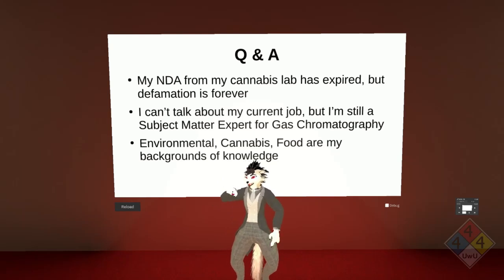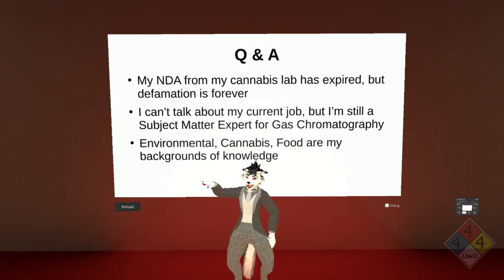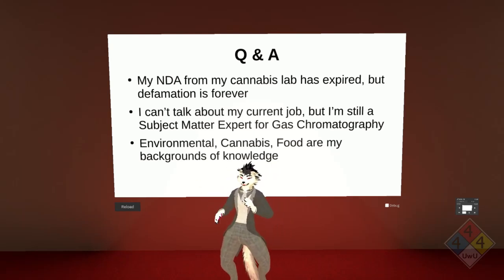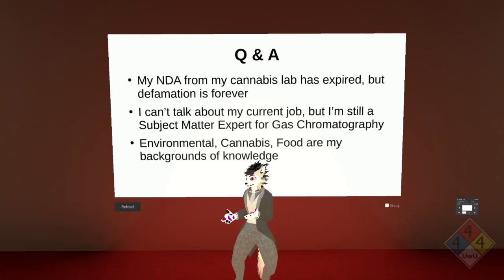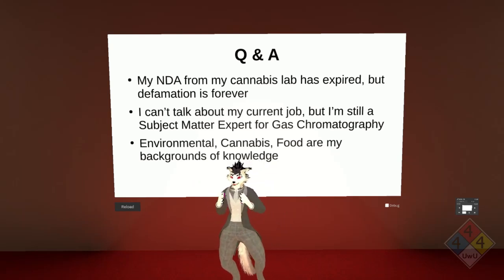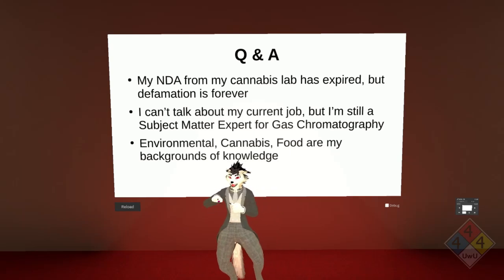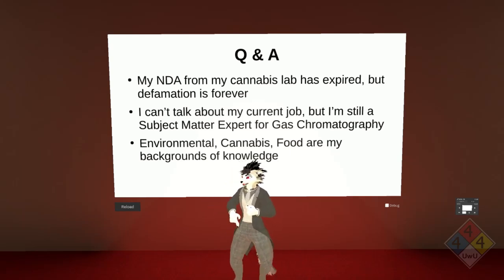And this happens very quickly, by the way. So you're doing a scan very, very quickly. You're going through, selecting out the different masses, which in this case correlate to elements, right? Because it's so thoroughly ionized that it's no longer in its original molecular form. It's down to its base elements. So those elements are then hitting the detector, and you're getting a quantifiable signal, which a computer calculates.